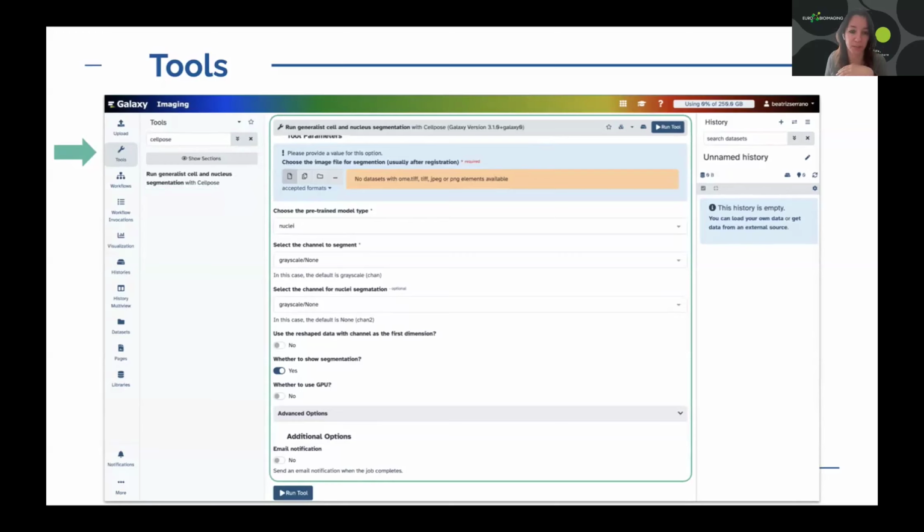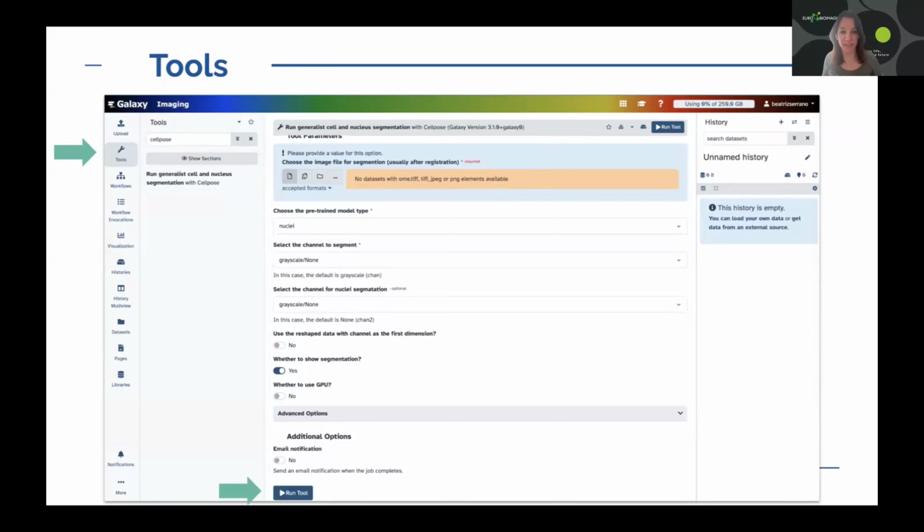And when you finish putting everything that is relevant for you, then you go to the run tool and execute it. And that triggers a cascading of events that are submitting a job to a cluster or to the cloud or to some infrastructure that in principle you don't need to know. All you need to do is to press this button, and then something will happen there and it will go and run somewhere else that maybe we don't even know if it's in the same local server or it goes somewhere else. So that's totally transparent to the user.